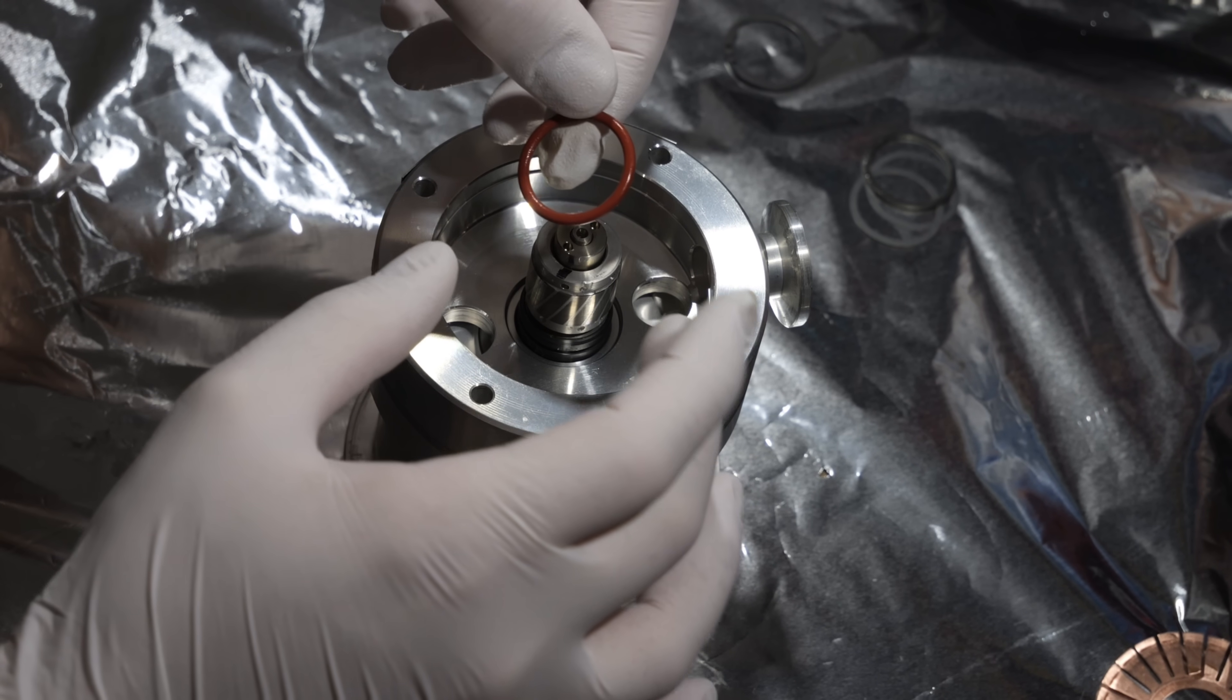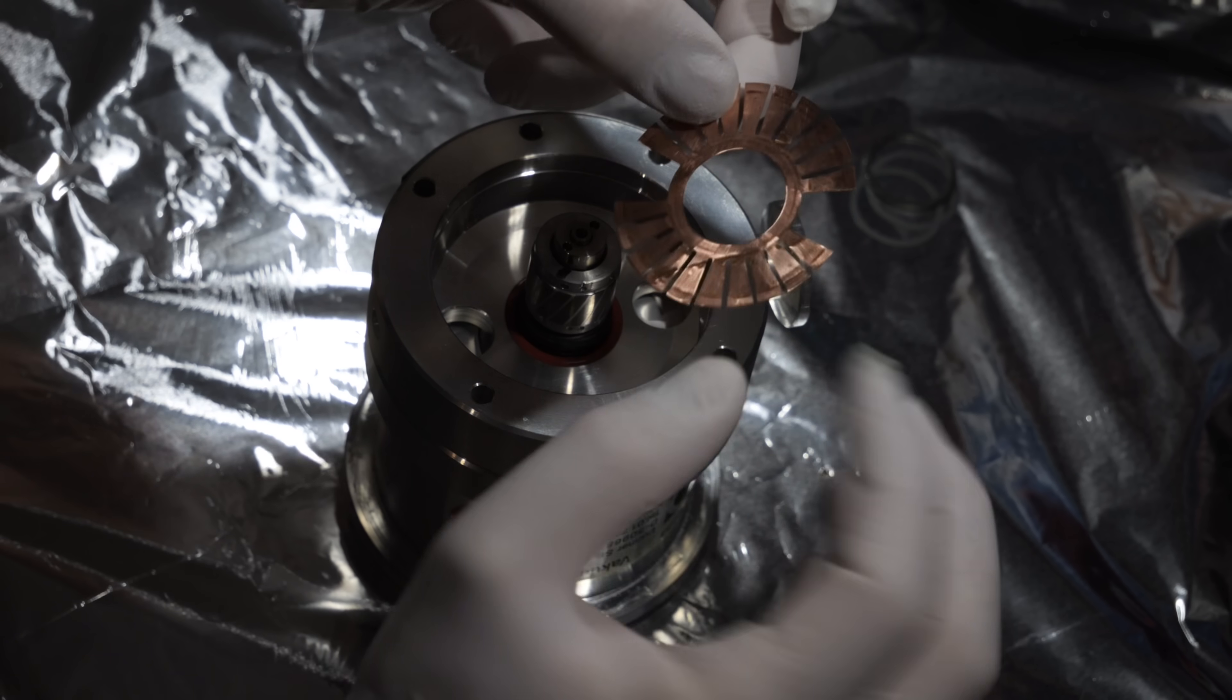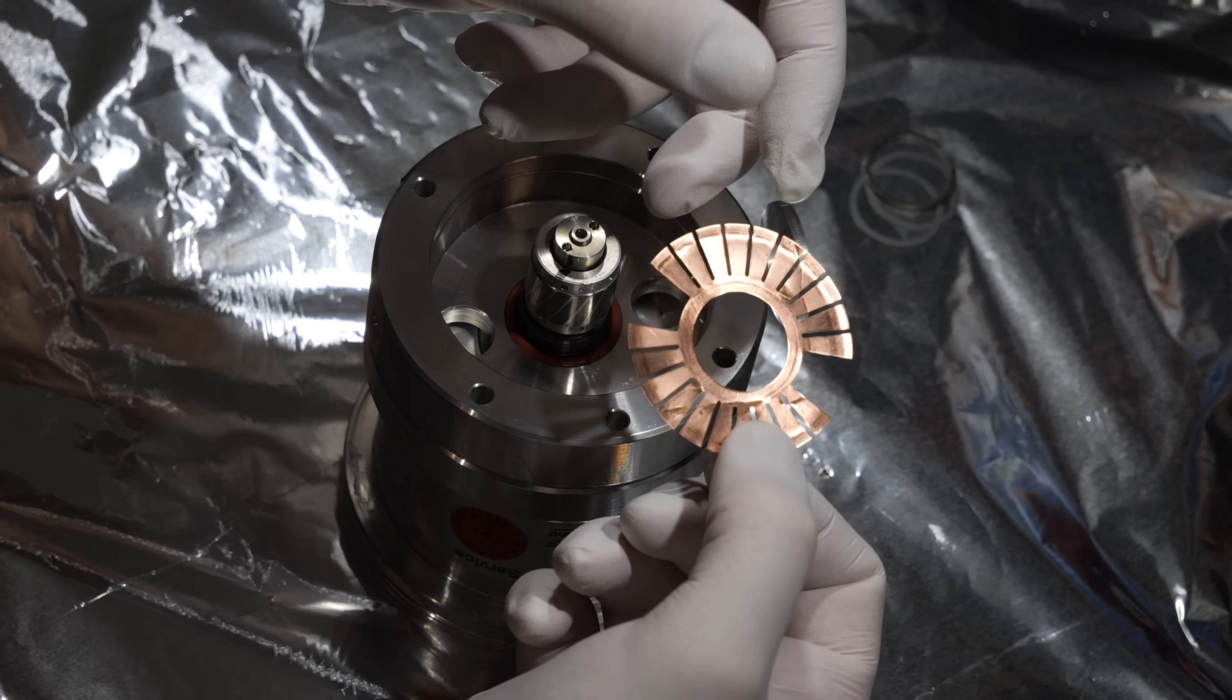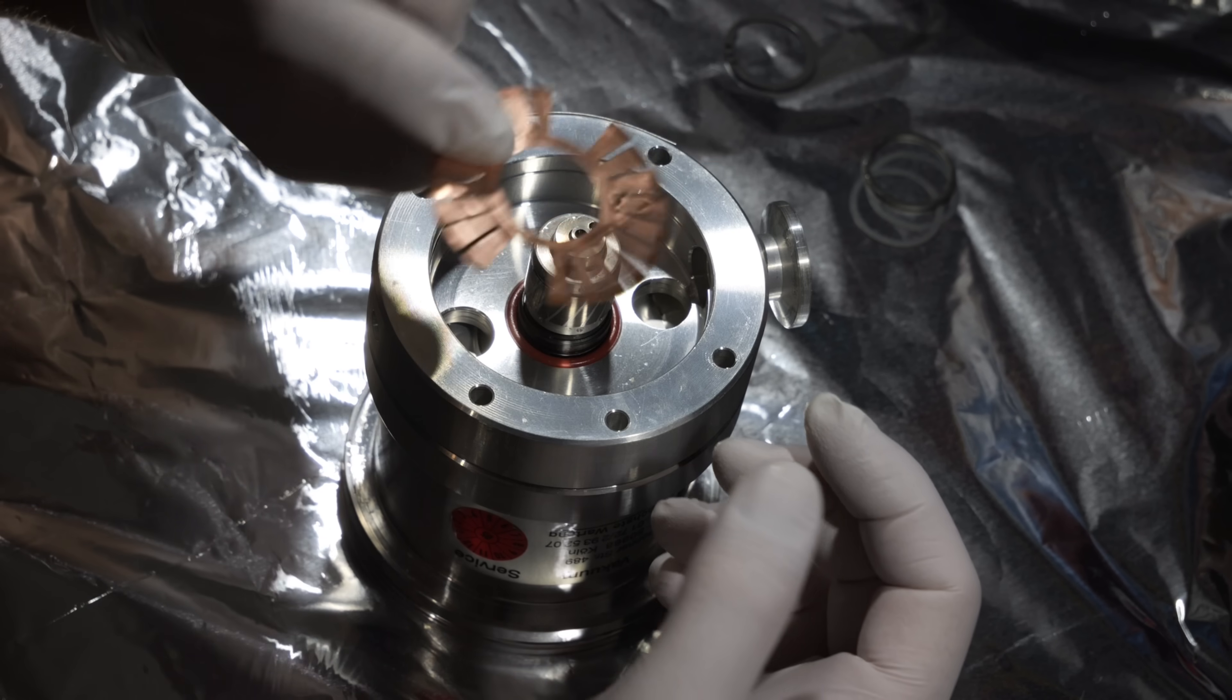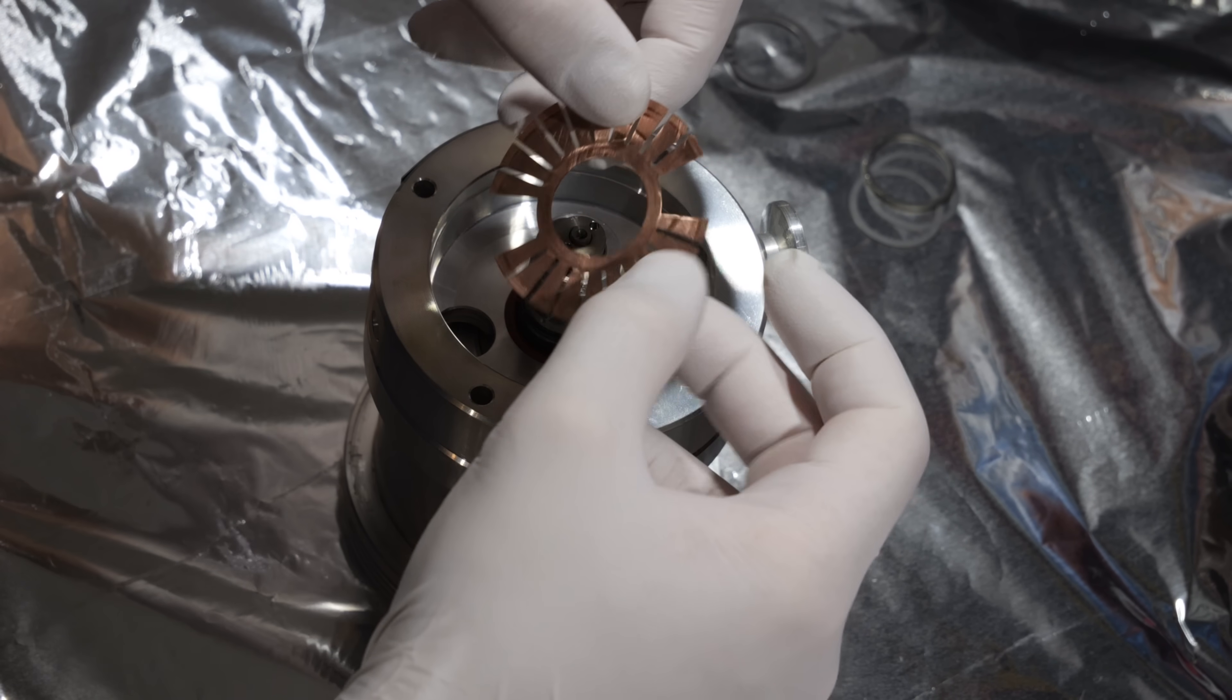Then there is another o-ring which sits down here around the shaft. Then comes this mysterious copper piece right here which I just cleaned. And as I've said if you know what this is let me know in the comments. I have no idea what it is used for.